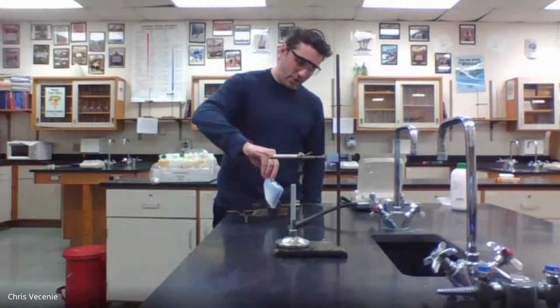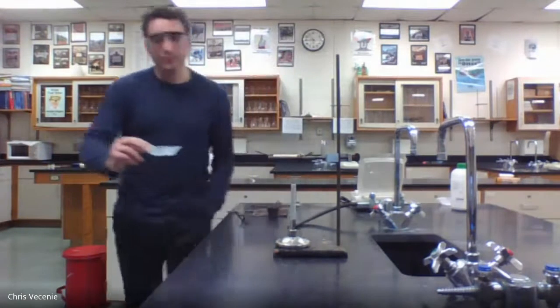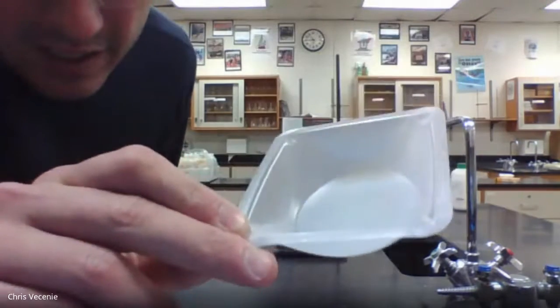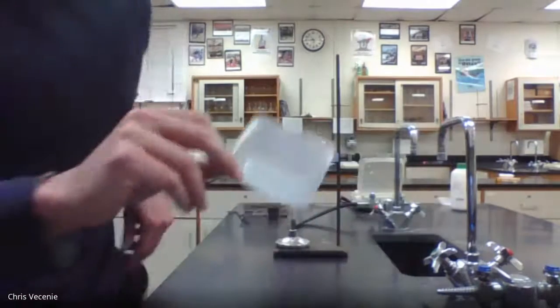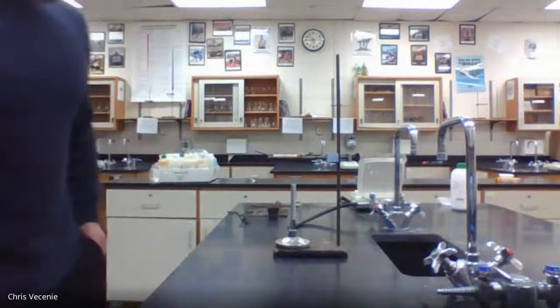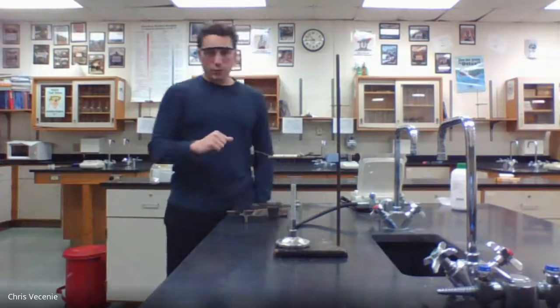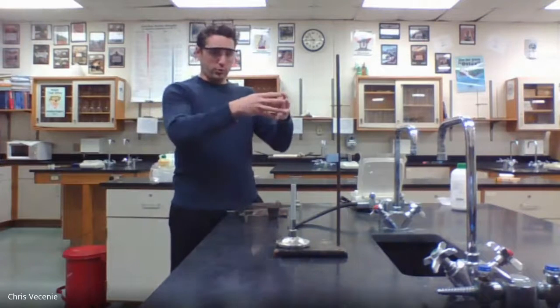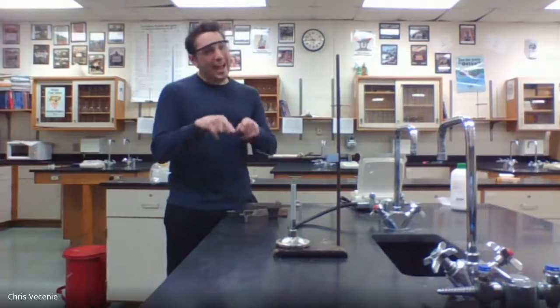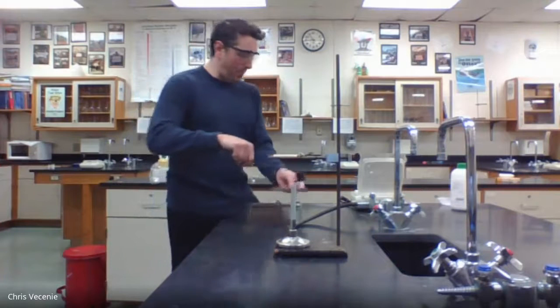And this is why we do this. What you are going to see when I do this is that on that dish, there is white solid still coating some of it. And if I tapped it, you'd see it fall. That means not all of my 2.17 that the balance said I had made it into the crucible. This is why we do the empty crucible, then the crucible with the white solid and the lid, so we know exactly how much white solid was in there. All right, so I'm going to take that substance back over to the balance.